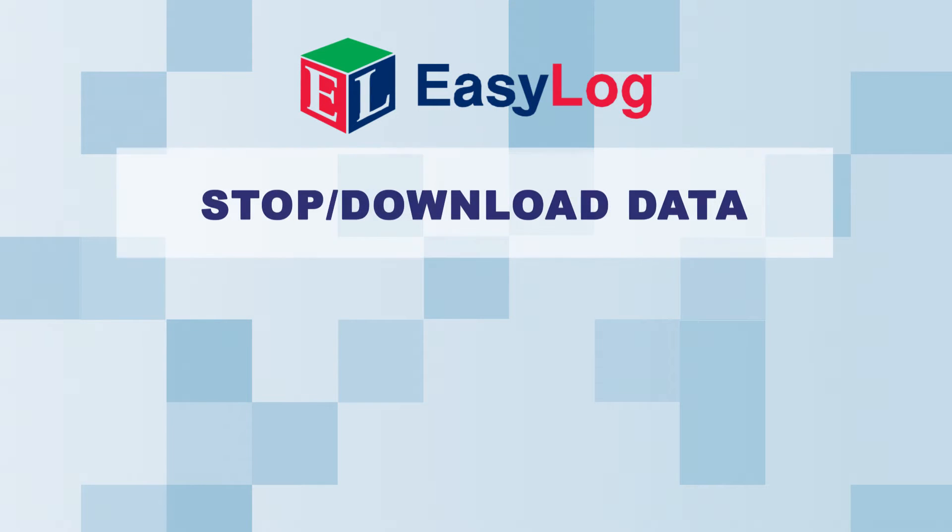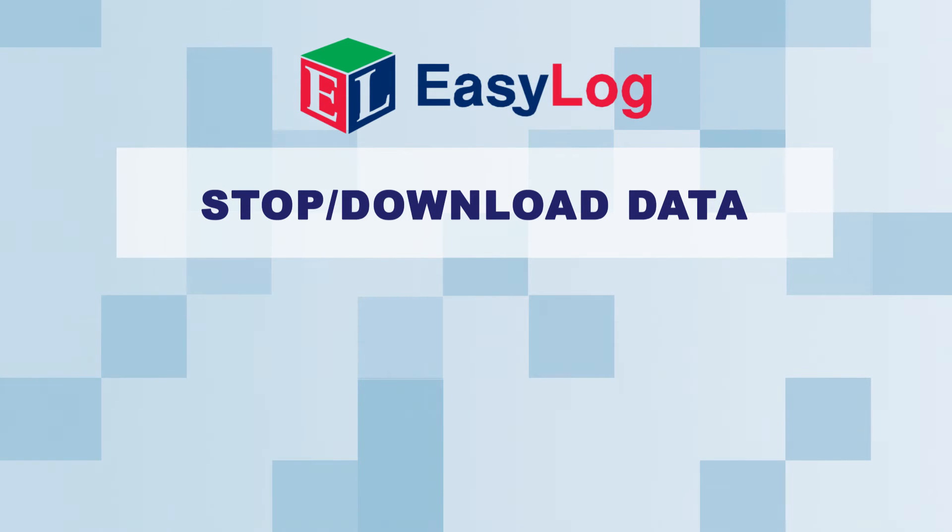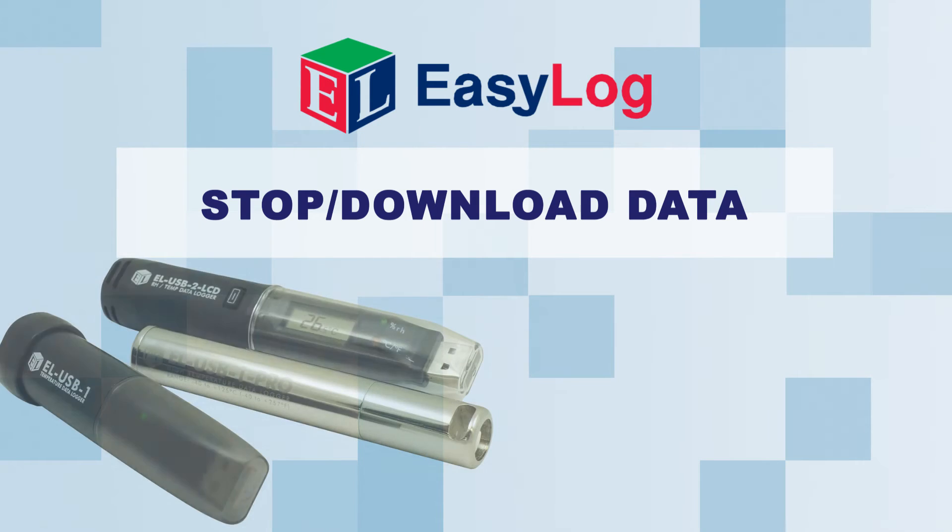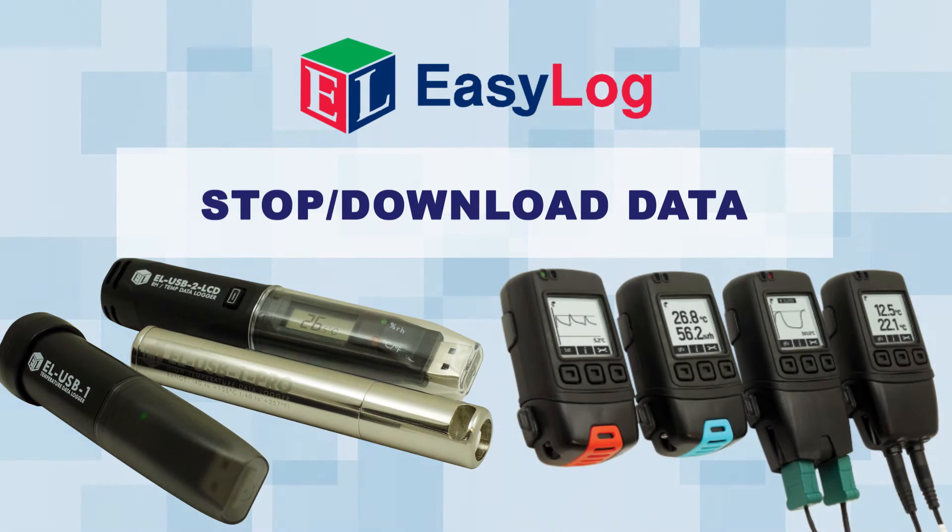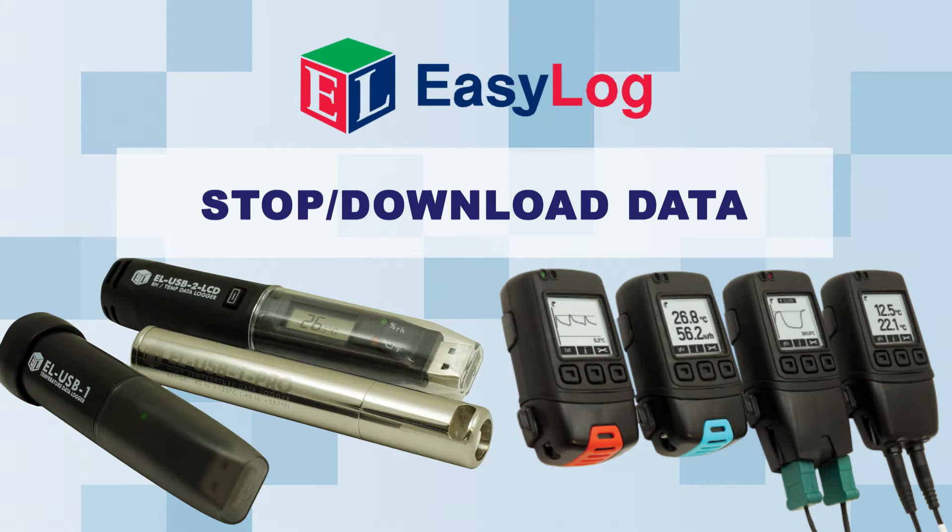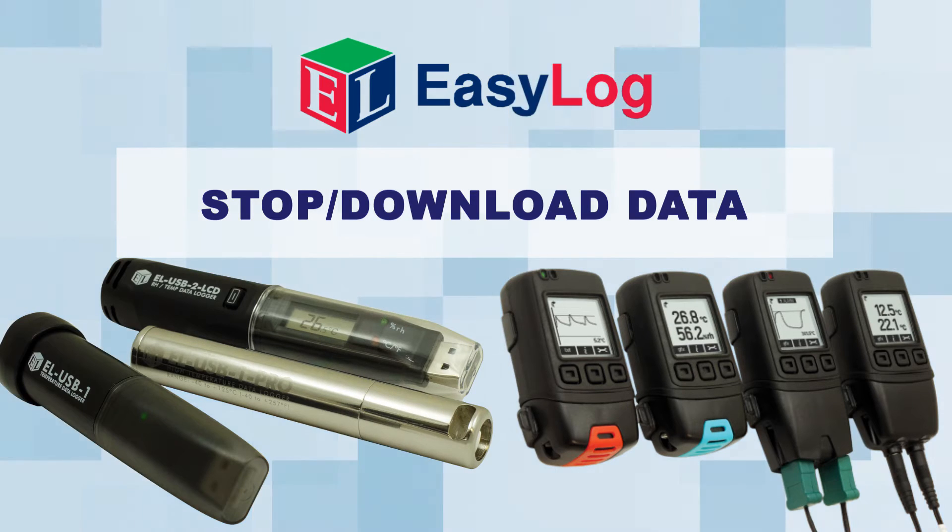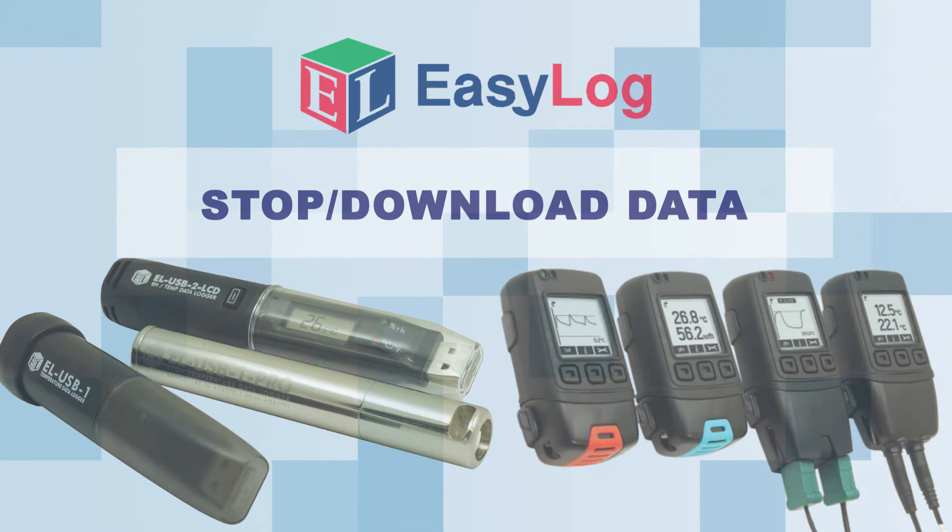In this video I will be showing you how to stop and download data from your EasyLog USB or GFX data logger. Today I'm using an EL USB 2 LCD data logger.